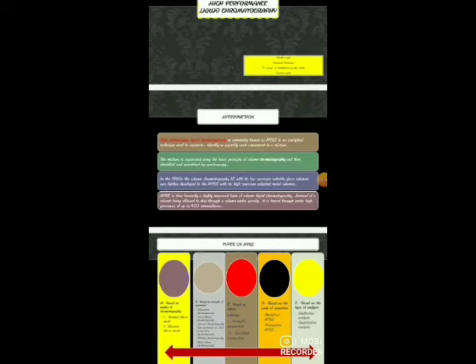Now in HPLC we use mobile phase and stationary phase and column. So the commonly used solvents are methanol, water, acetonitrile. We add to the solvent acidifier, basifier and buffer solution for better separation.